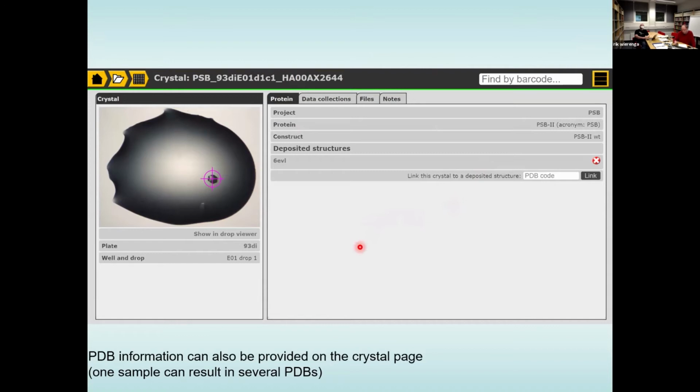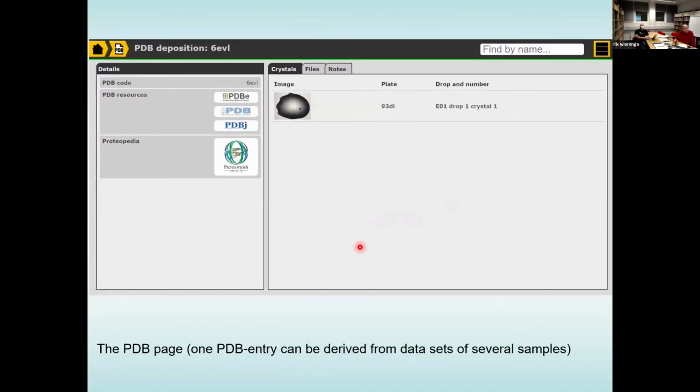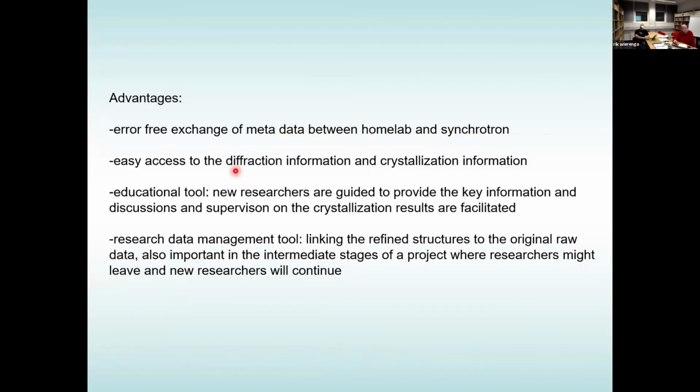If you click on that link, you can reach the PDB page, and there are links to various other web pages with information on this structure.